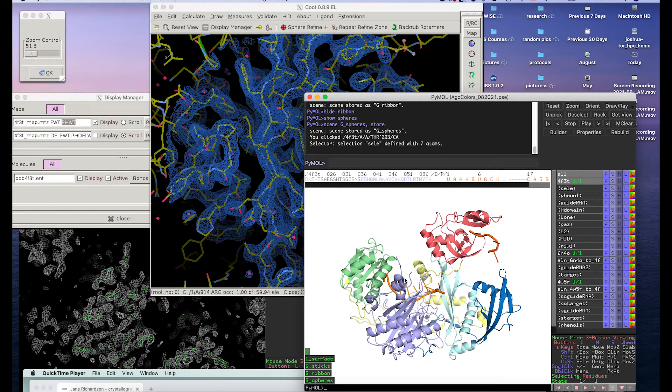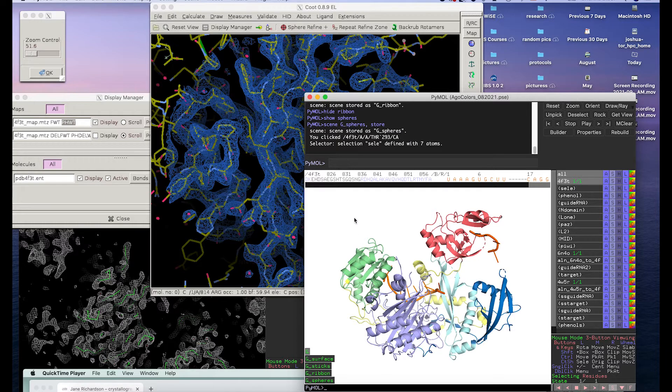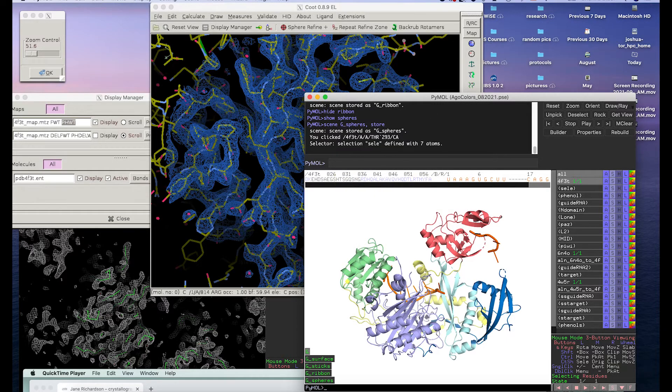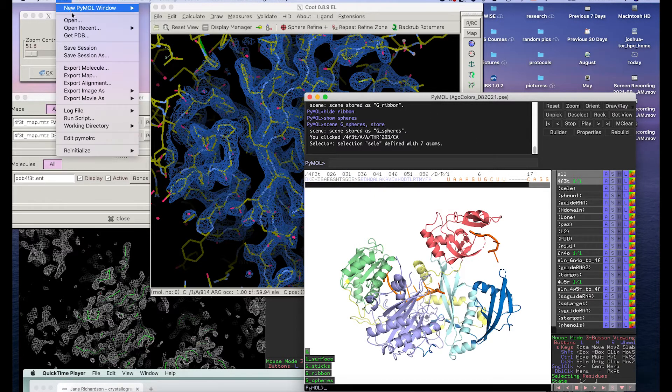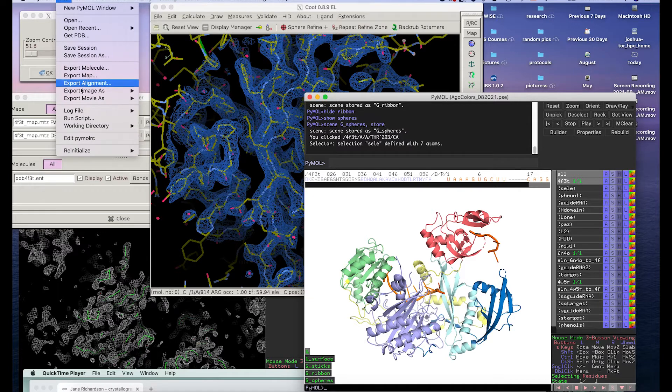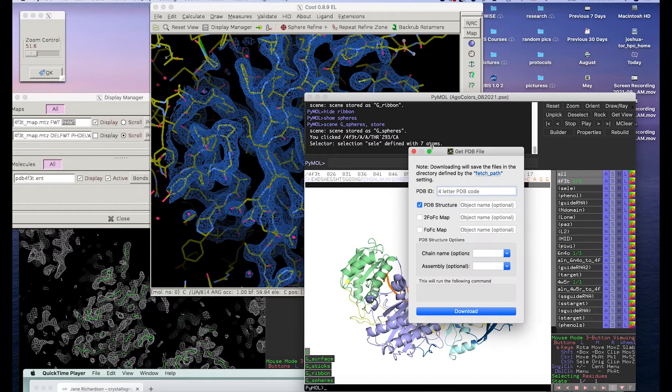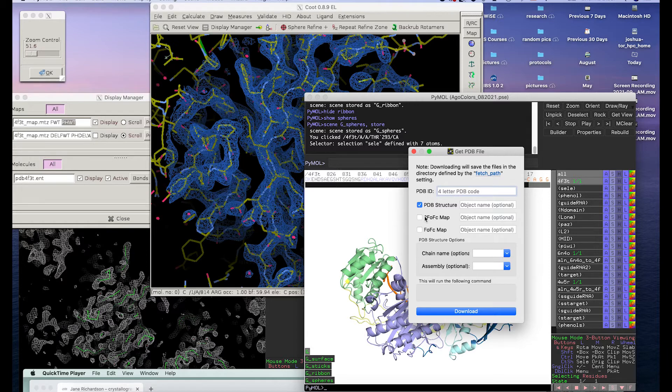So with Pymol, if you just do Fetch, it's just going to download the structural model. But if you do get PDB, then you can download the maps as well.